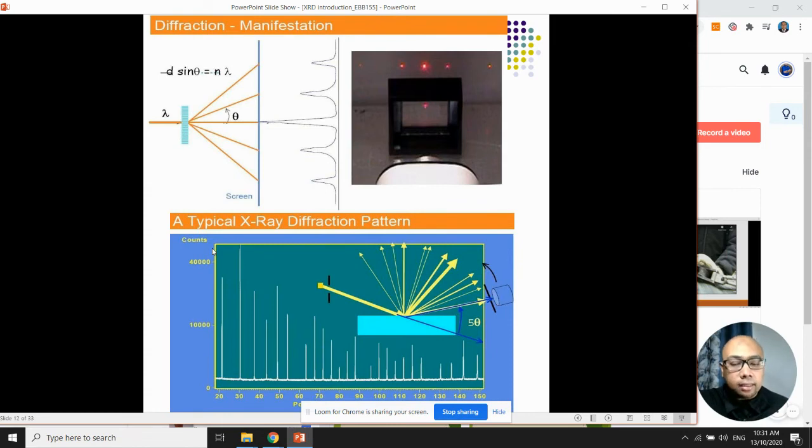This one we call a diffractogram for XRD. Remember, each material has its own fingerprint. This diffractogram pattern we call a fingerprint. What happens if we mix two or three compounds in a mixture? You can get many peaks appearing, representing the different compounds in the mixture.